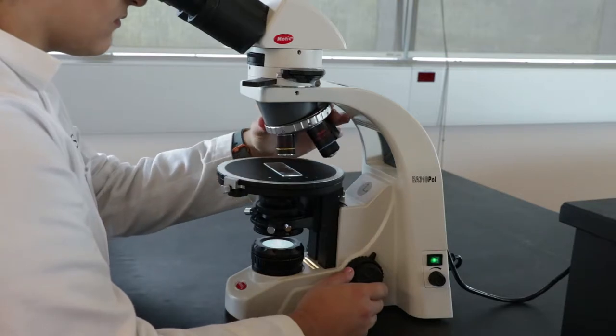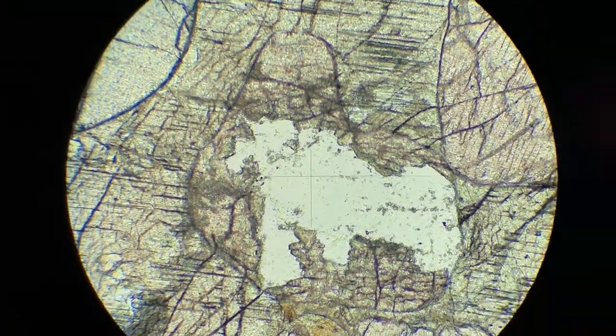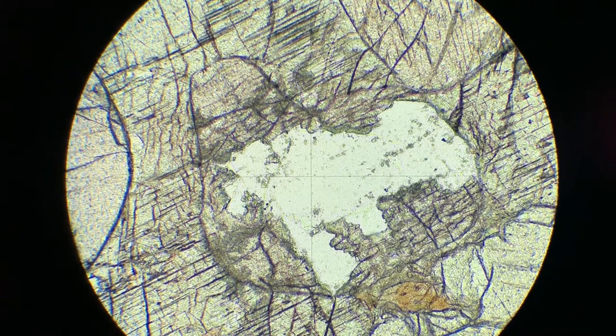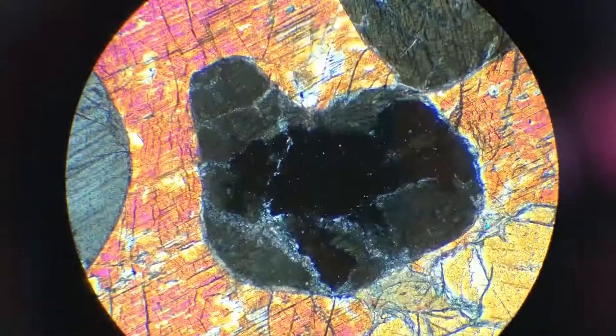Finally, some slides have holes in them. They may not be obvious under plain polarized light, but under cross polarized light, they will remain extinct at all degrees.